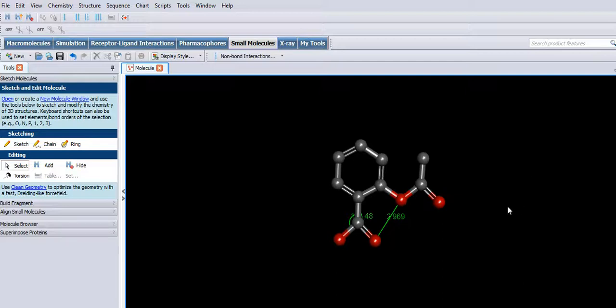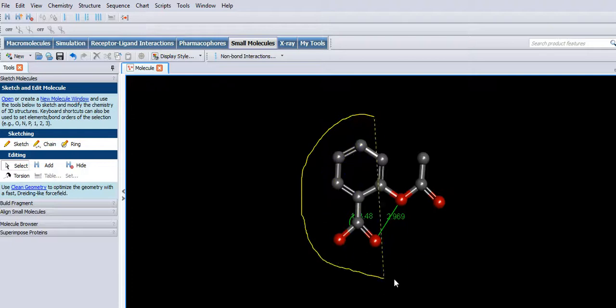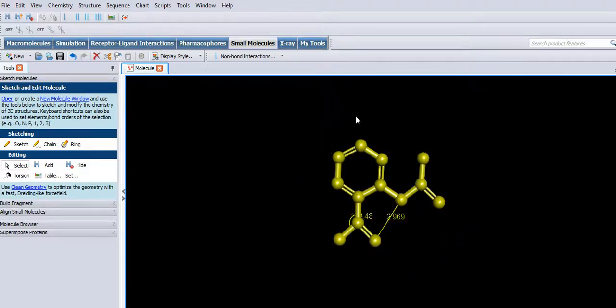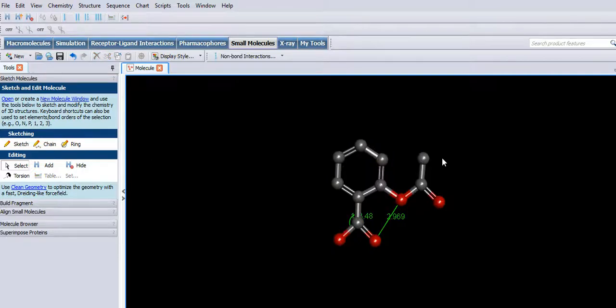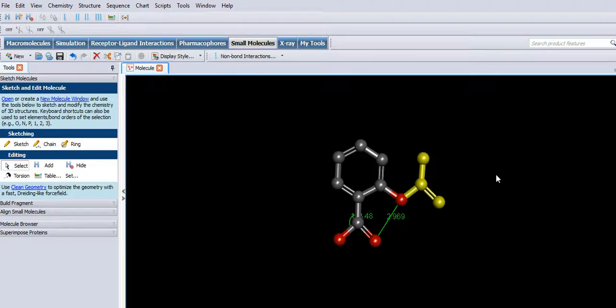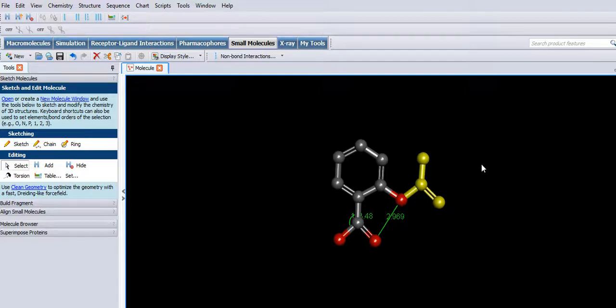So I can show you what the left mouse button does. That's just holding it down continuously. There are other ways of selecting everything, but that's a quick way of doing it. You can step past the molecule. So if I were to hold down control and right click, it should rotate it.